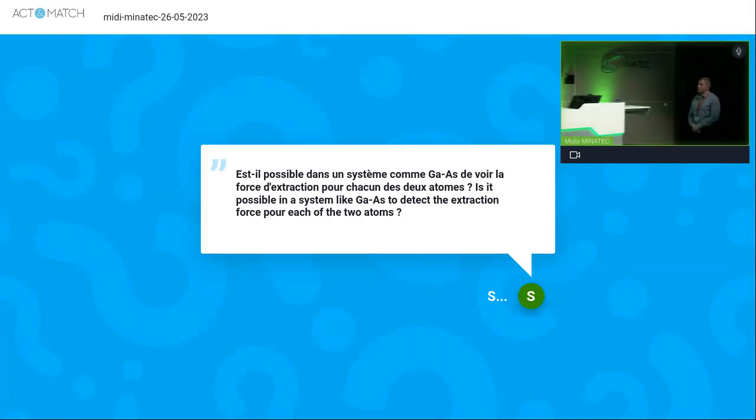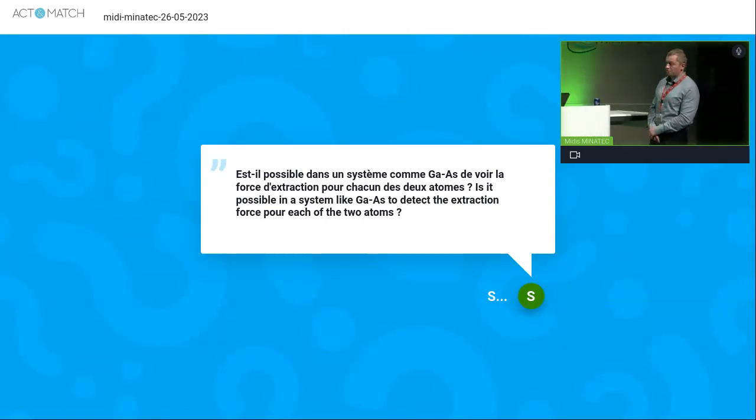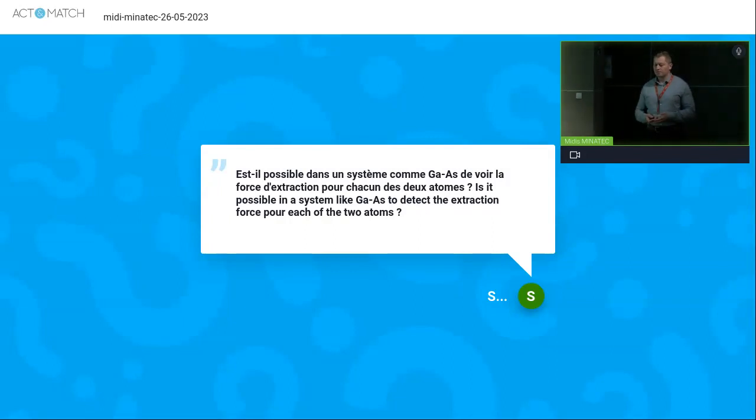I never did this, but the main problem is that firstly you must maybe go to atomic resolution to have access to atoms first, and after, if we are talking about single atoms, to calculate this. So it's very difficult to have such resolution with electrical characterization.